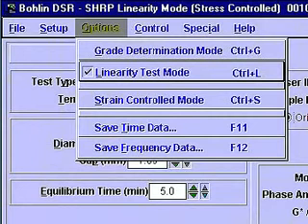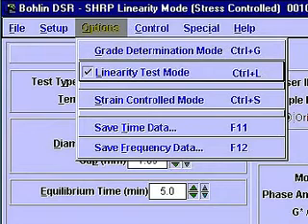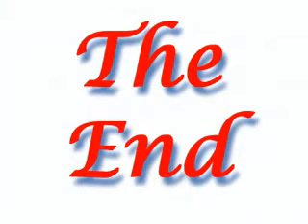If desired, temperature sweep testing can also be done to determine the critical temperature. In this procedure, the test temperature is changed by 3 or 6 degrees and the test is repeated. This procedure is automated in the DSR's software.